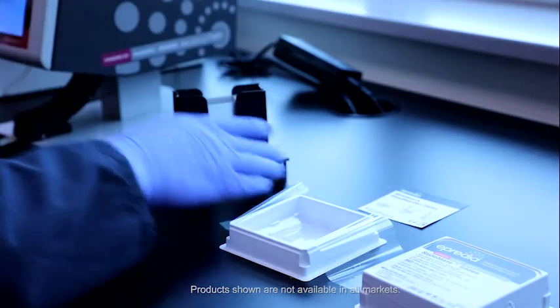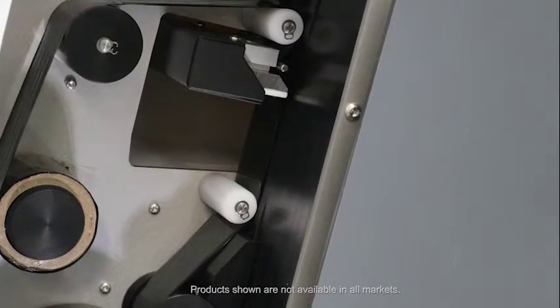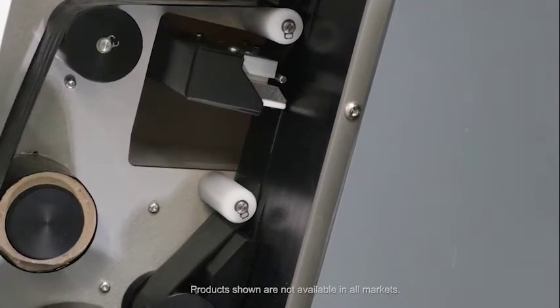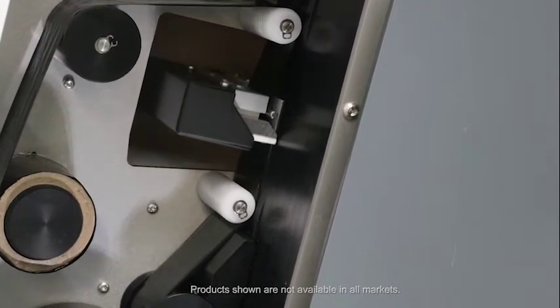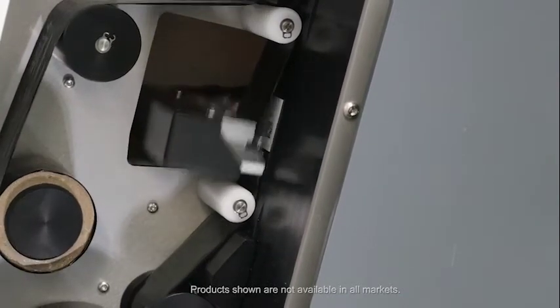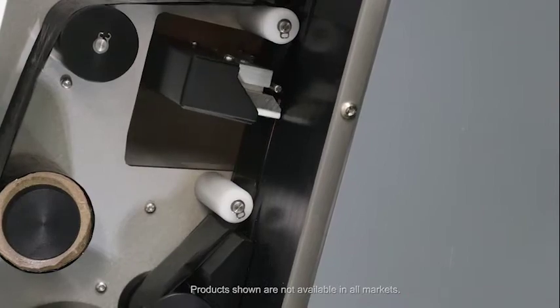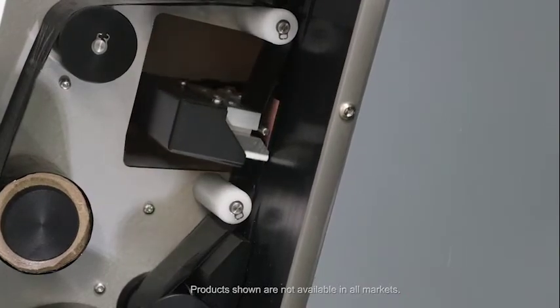Inside, the SlideMate Pro is designed for efficiency and reliability. The high-capacity ribbon lasts for about 12,000 impressions per roll at 300 dpi.